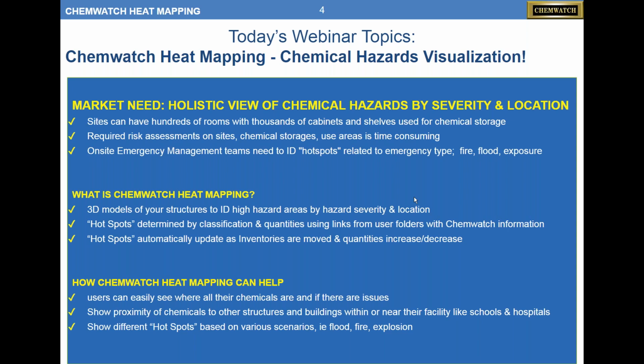So I guess the final question is, how can Chemwatch heat mapping help? Well, users can easily see where their chemicals are and then understand what accommodations are needed. Maybe we need to split this room in half. Maybe we need to spread these out. Just helping you with that. The proximity of chemicals to other structures in the building might be important. What's on the other side of this wall? And how hot spots differ based on different scenarios: flood, fire, explosion, things like that.